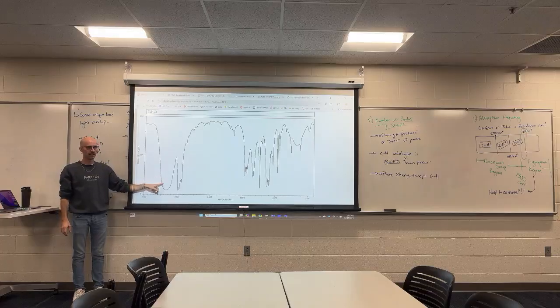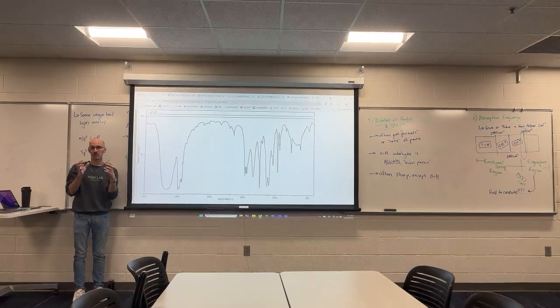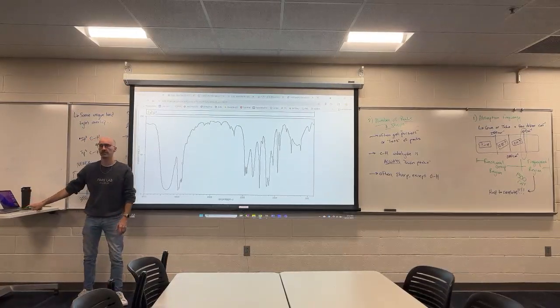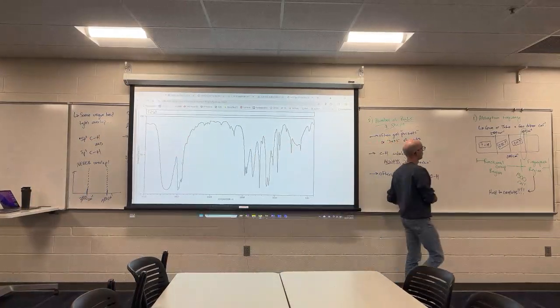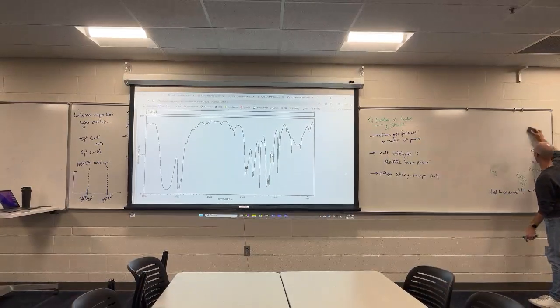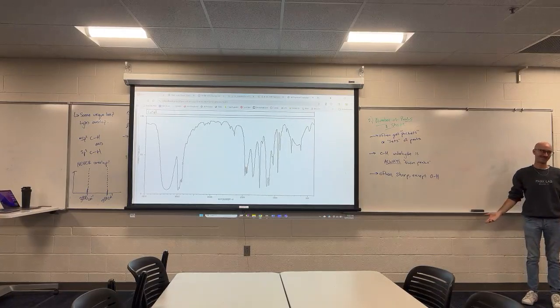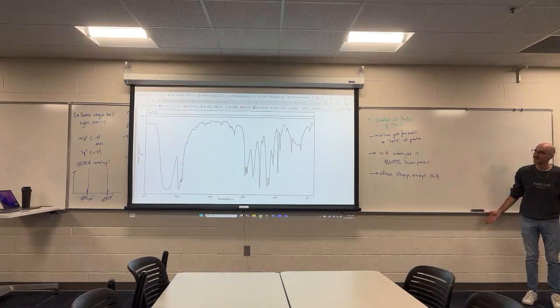But what about this guy? It's actually a lot of different frequencies that allow its bond to stretch. Why is it that the OH bonds can absorb a much broader range of frequencies in order to get their bond to vibrate? Any ideas? Is it because of how uneven the split between the oxygen and the hydrogen is compared to everything else on there?